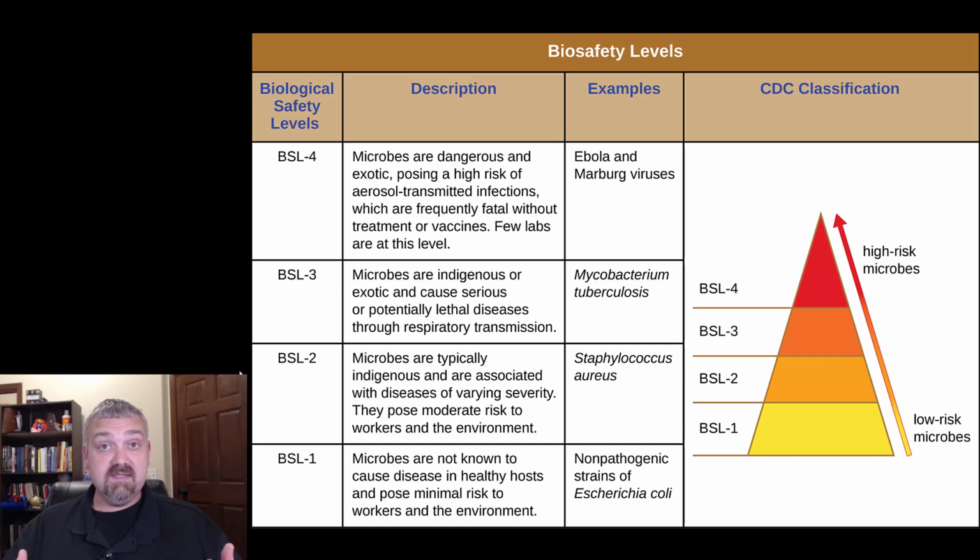Now, I'm still always worried about the potential for what are called opportunistic pathogens. So let's say you have cuts on your hands, we're going to take special precautions there. If you're immunocompromised, we'll take special precautions there, but in general, these are pretty safe. A couple more examples, because this is how I like to work. I like to actually expose you to, pun intended, I guess, low-level BSL-1 organisms that can still teach you about the much more dangerous strains.